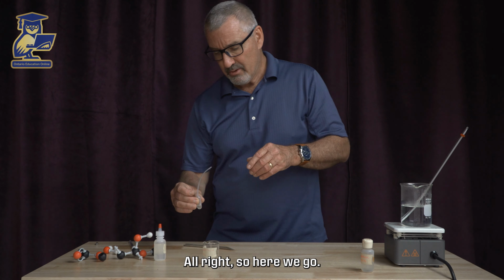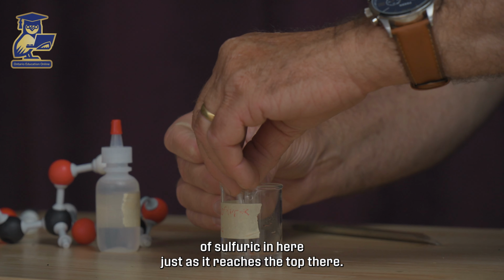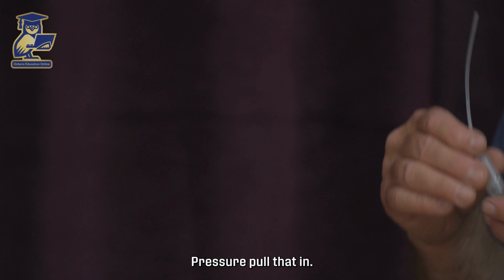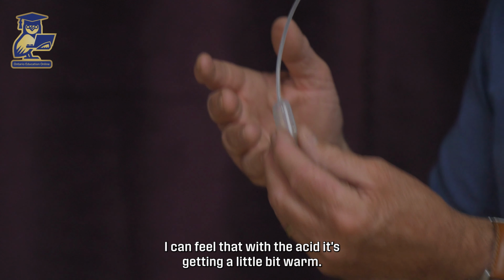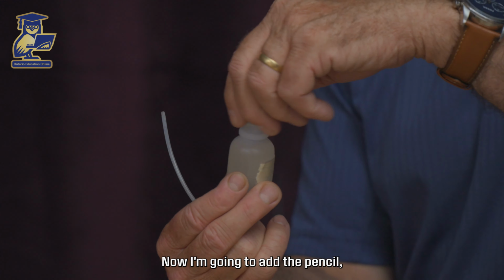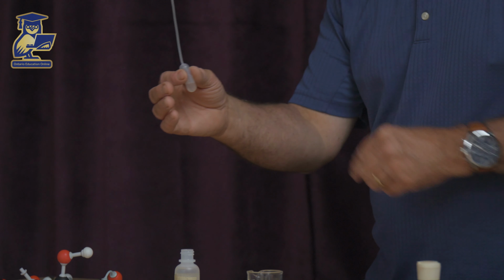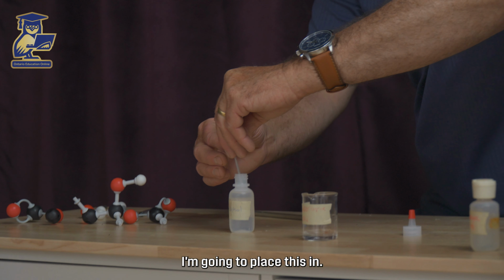So here we go. I'm going to put just a little bit of concentrated sulfuric in here, just as it reaches the top there. That's perfect. And I'm going to let gravity pull that in. I can feel that it's getting a little bit warm right off the bat, with the ethanoic acid. Now I'm going to add the pentanol, which is my alcohol. I'm just going to squeeze that out. I'm going to place this in.